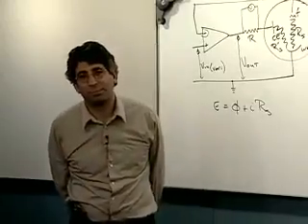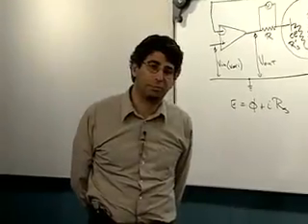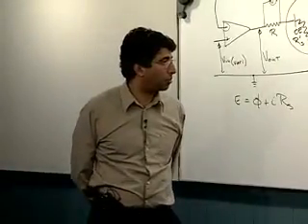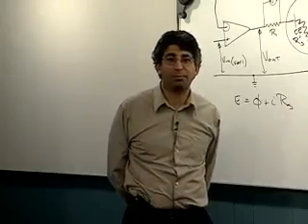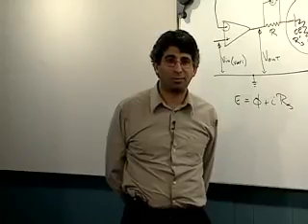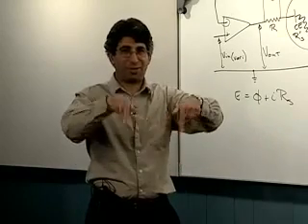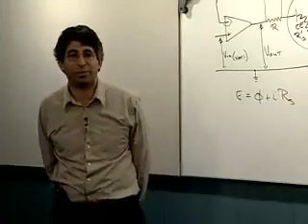When you measure the Fe and the silver nitrate, are you measuring the open circuit potential? Yes, exactly. So you don't have any junction or whatever. You just use some supporting electrolyte with a high concentration of salt in it so that you don't have a problem. Oh, so you're saying it's not really open. That's open. You take your favorite supporting electrolyte, put your two references in there, and just put a voltmeter across them. A voltmeter is high impedance. It's open circuit for all practical purposes.